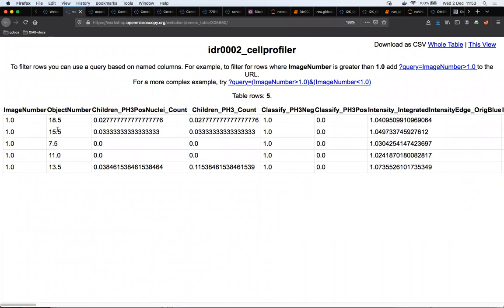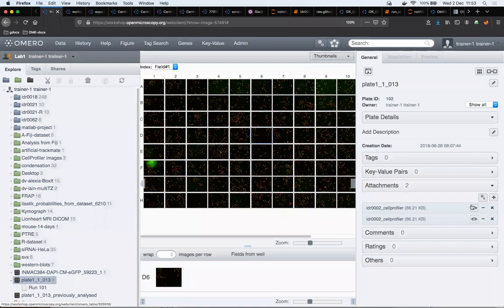This is because in that script we previously collated results so that each well has 1 single line. This is because OMERO.parade needs a single line for each well. OMERO.parade is the data mining tool, which we will show just after the break.